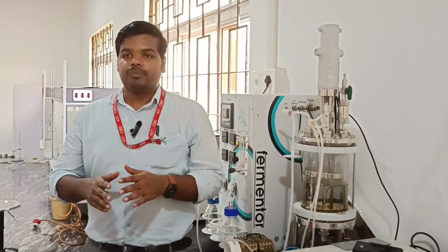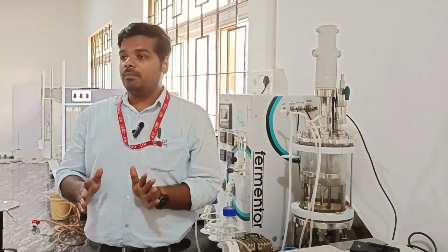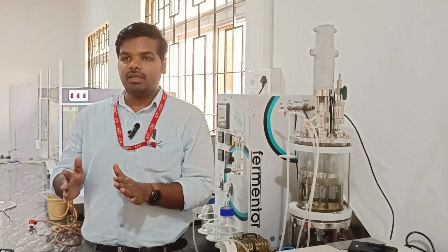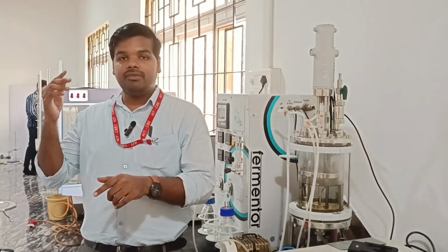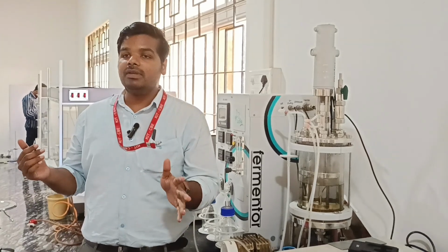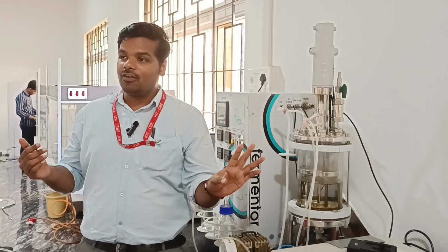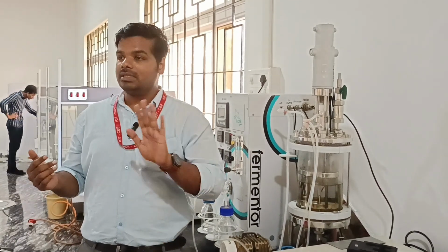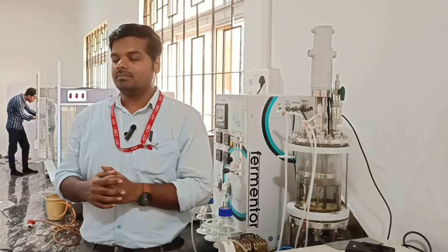In our experiment, as I said, I am calculating del heating and del cooling. From that, using the previous data, I am calculating the holding time which is required for killing the model microorganism. The model microorganism is the thermophilic bacteria.